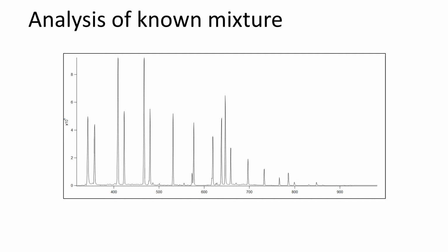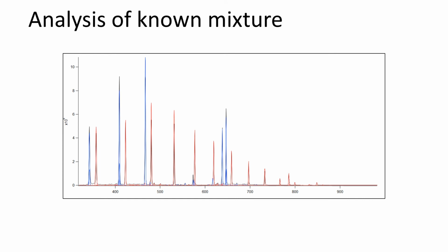This figure presents the total signal of a chromatogram with injected alkanes. After the analysis was done, the analytes found mainly from the blank solution are presented here in blue, and the analytes found from the samples are shown in red. The results indicate that all the injected compounds were identified along with additional compounds, which could indicate the presence of contaminants.